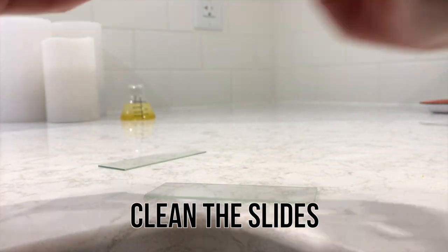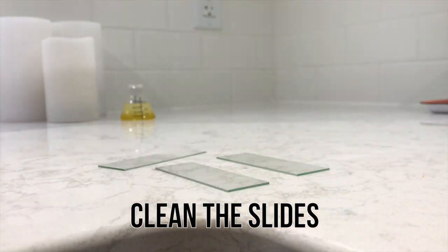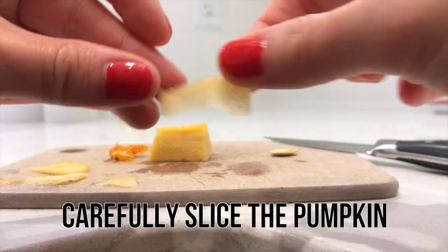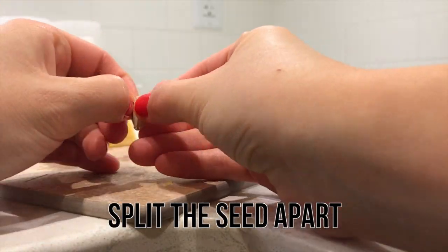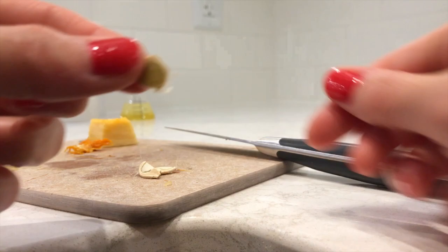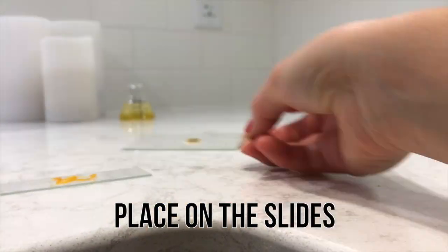Next, I cleaned three microscope slides. Cut a thin piece of pumpkin that you can see through. Then split up a pumpkin seed and get a small piece of the shell. Cut a small section off of the pumpkin fiber. Place all three samples onto the center of the slide.